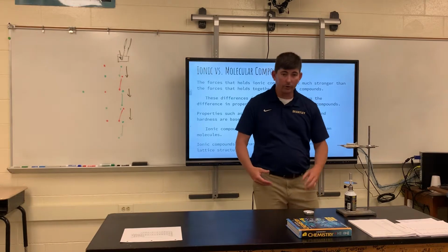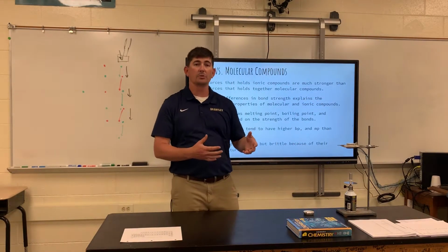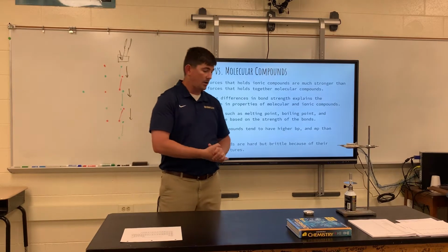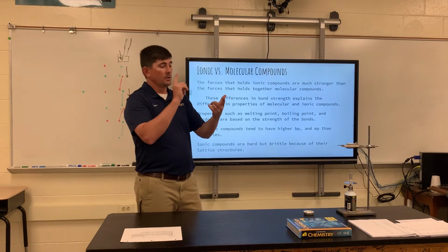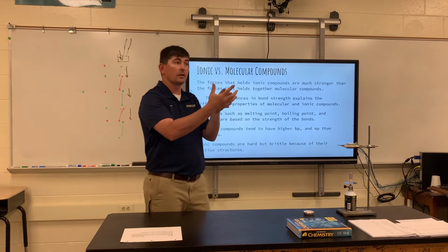And what we're going to do is simply turn on the flame. We're going to see what happens with the salt and what happens with the sugar. Sugar is a molecular compound, whereas salt is an ionic compound. Salt has a metal and a non-metal. Sugar is nothing but non-metals bonding together, right? Some carbon, some hydrogen, some oxygen bonding together to make sugar, so it is a molecular compound.